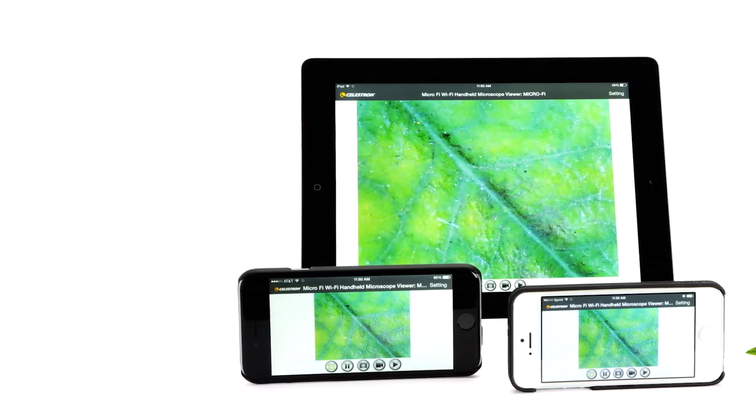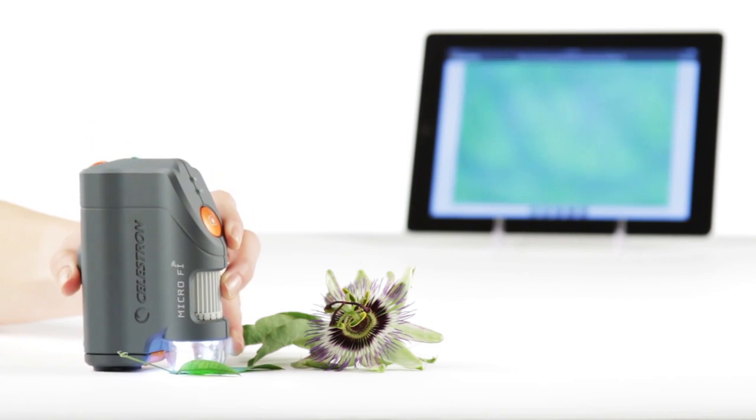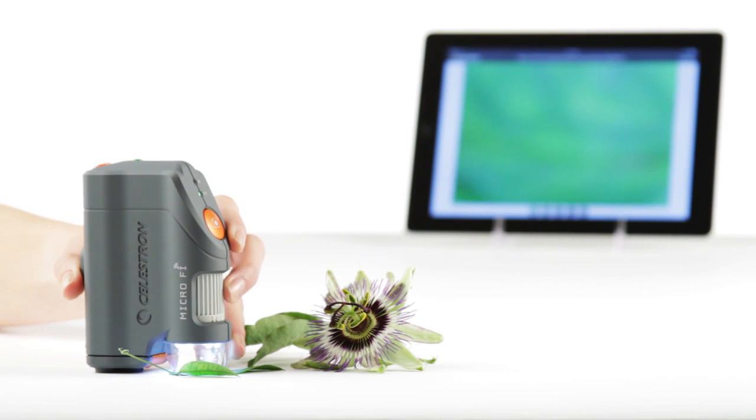With the MicroFi you can connect up to 3 smartphones or tablets. MicroFi's Wi-Fi signal reaches up to 30 feet, making it ideal for classroom or lab environments.